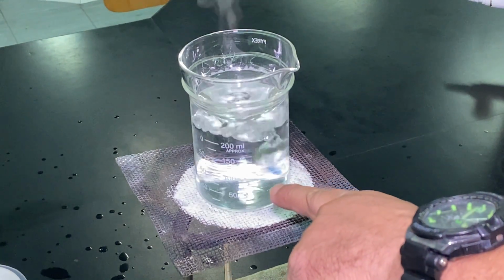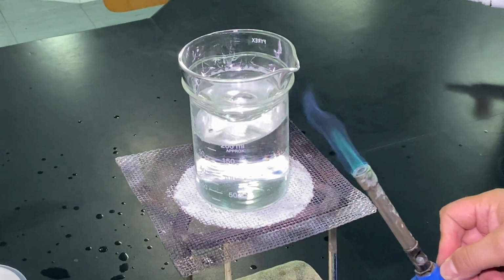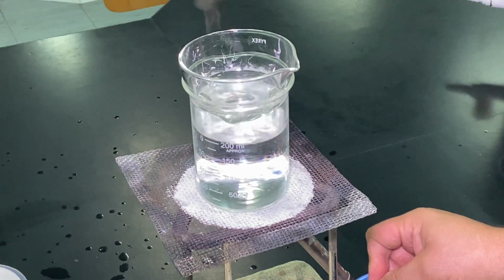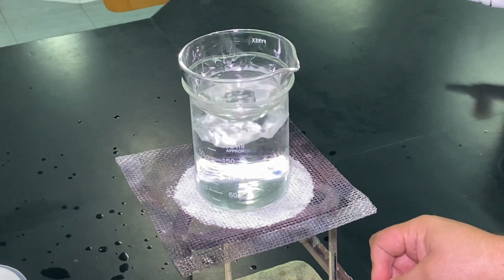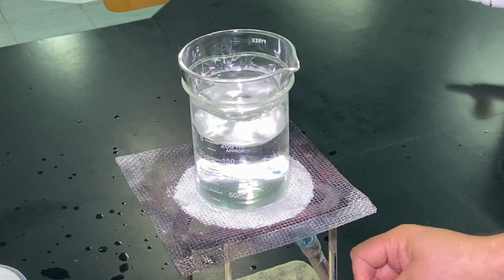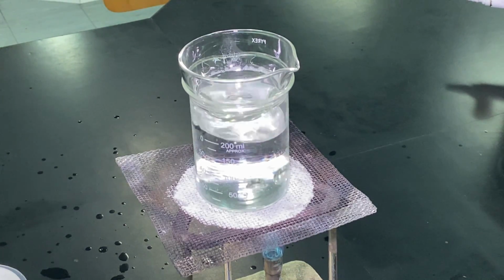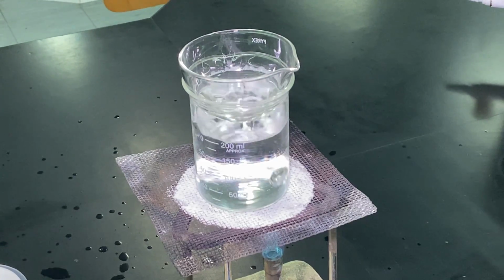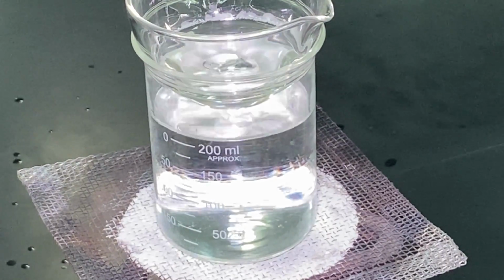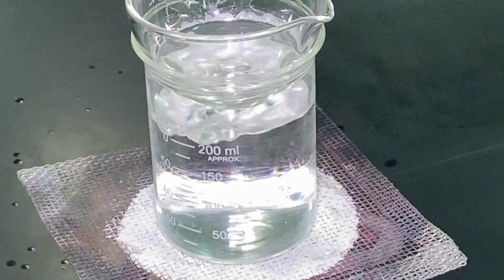So this is just boiling water. If we put the flame directly onto the evaporating dish, it will break because it's not heat proof. We want to do this as slowly as possible. Hopefully there you can start to see sodium chloride.